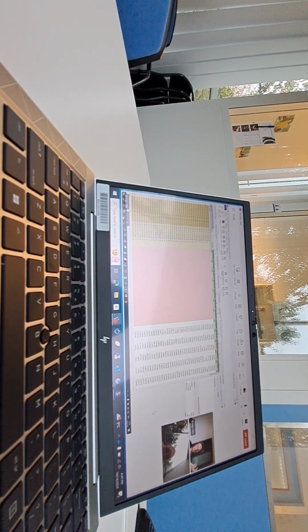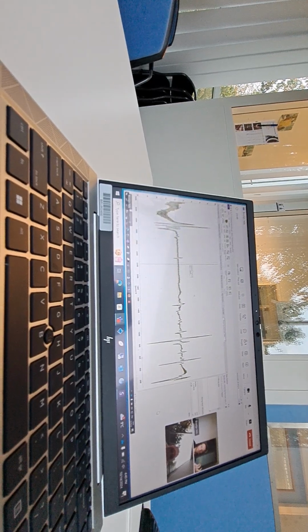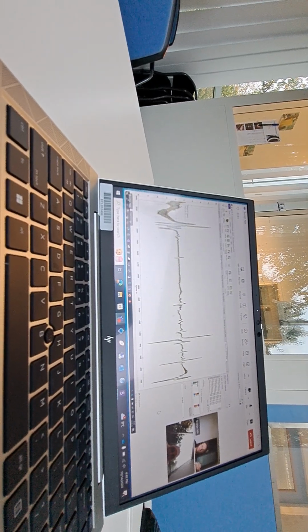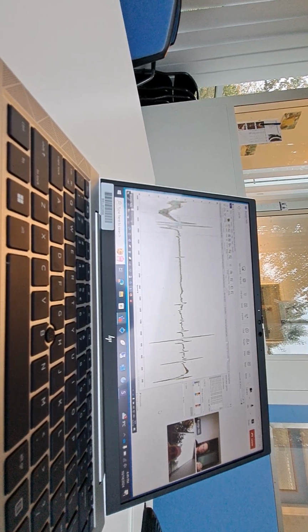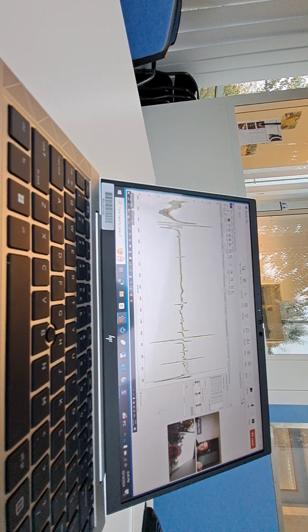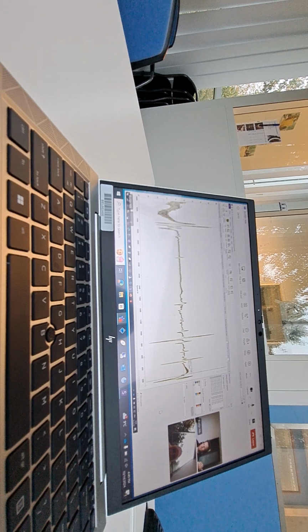So these are then completely pre-processed. But here I didn't remove the sides, and you see, with the derivative, it becomes crazy here, and in fact, there's no information here. So it's good to remove these sides.